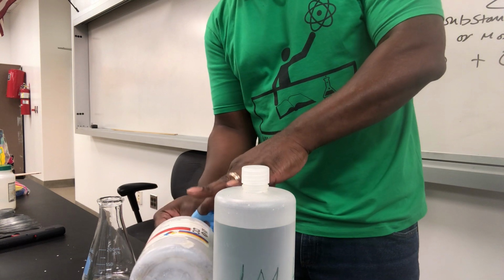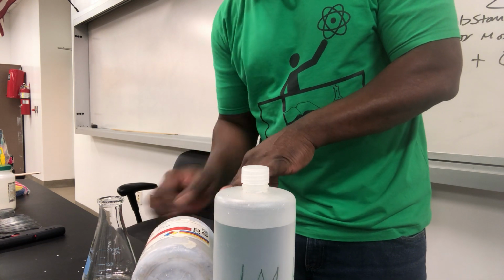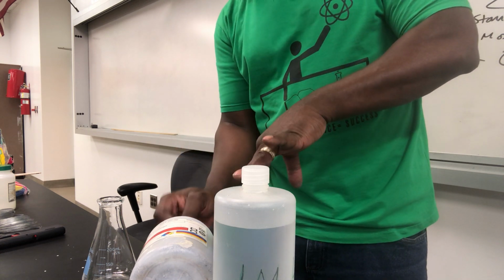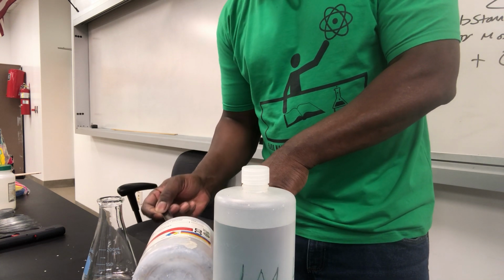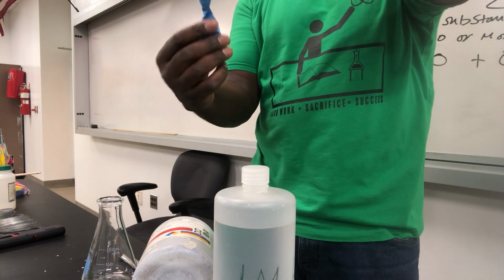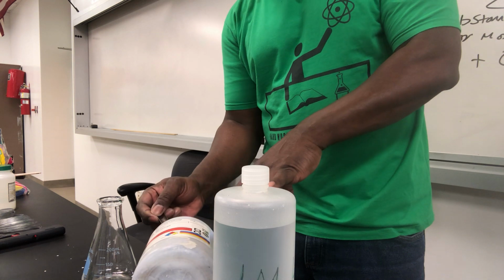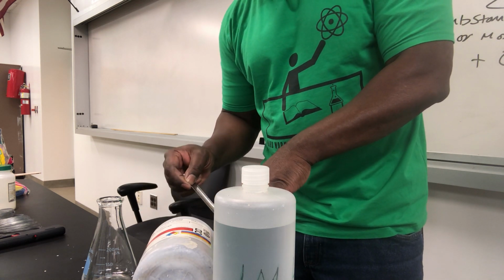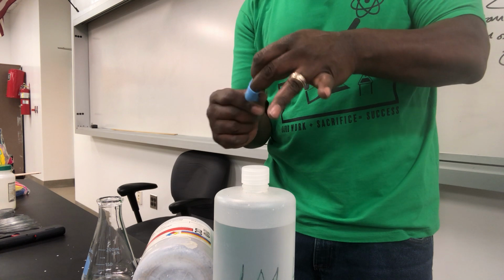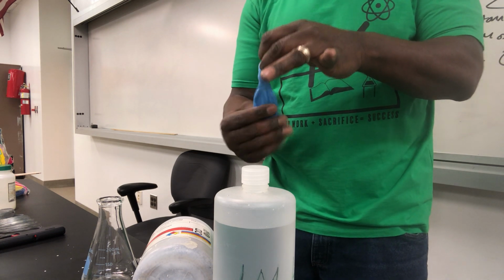There you go. Some more. I think I'll do one more to make sure I get Mg inside. So once again, I use Mg in the first reaction. I'm using magnesium again. Magnesium is pretty cool. There's a nice level of reactivity to it. It's not overly reactive, but it's decently reactive.